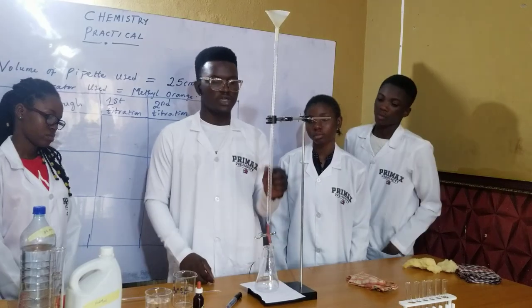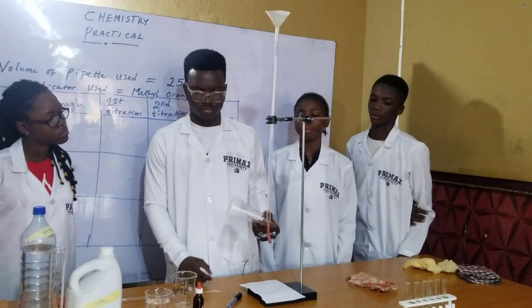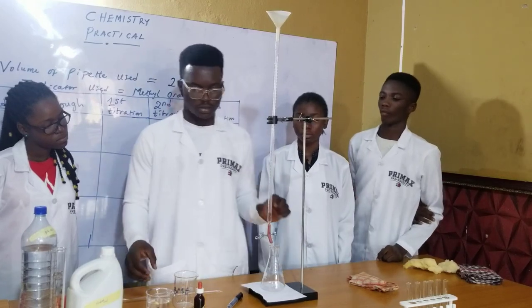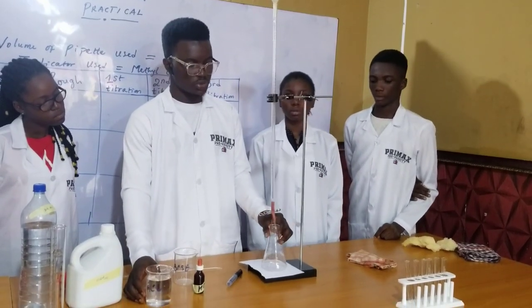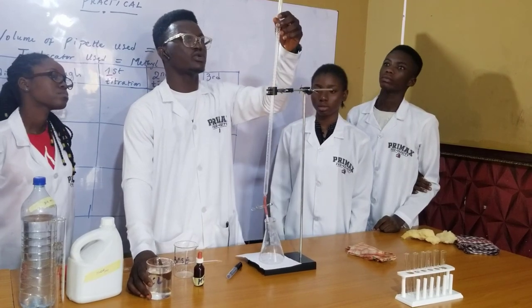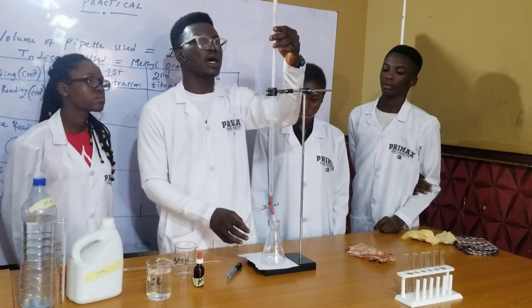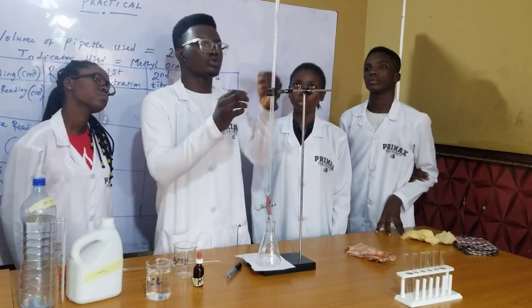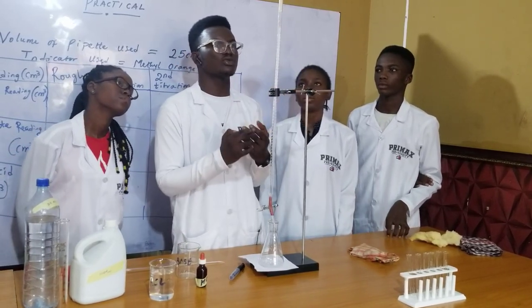I've rinsed my burette and rinsed my conical flask. Now you fill the acid — not to the brim — to the zero mark. You can see it here: to this zero mark.